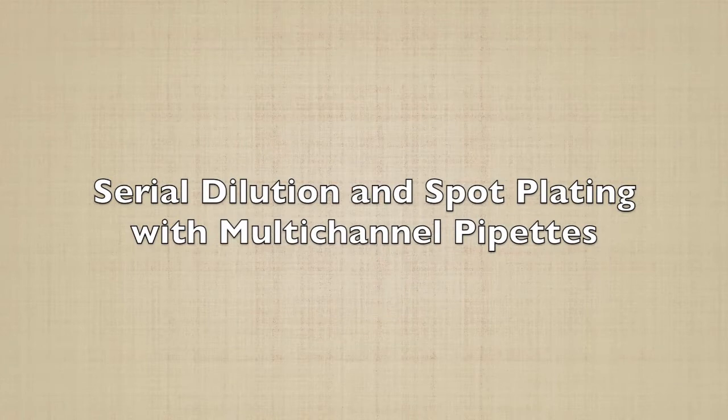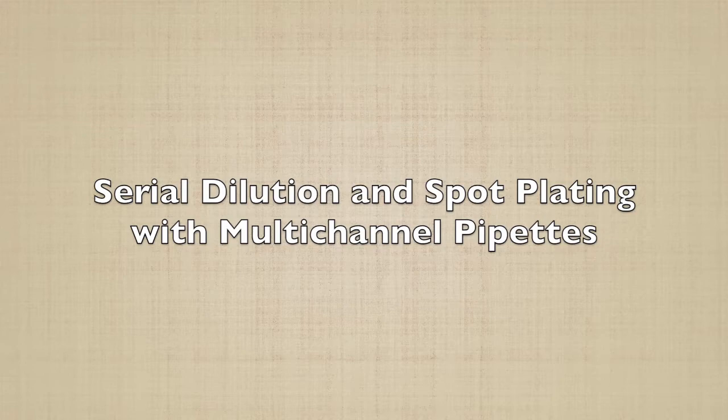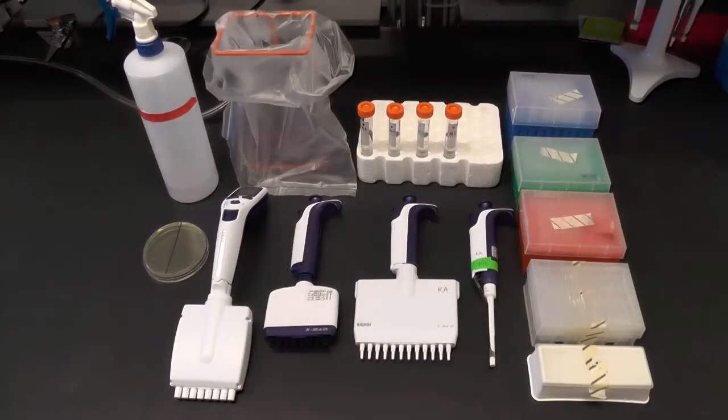In this video you will learn how to perform a new time-saving technique for serial dilutions and subsequent spot plating that involves the use of multi-channel pipettes. Here is the equipment you will need.